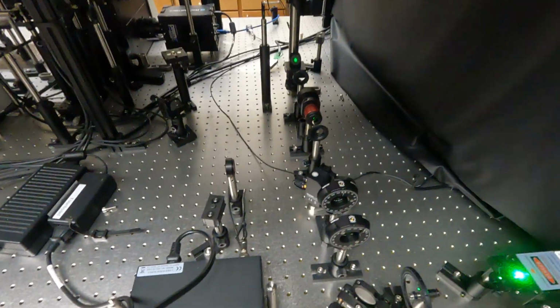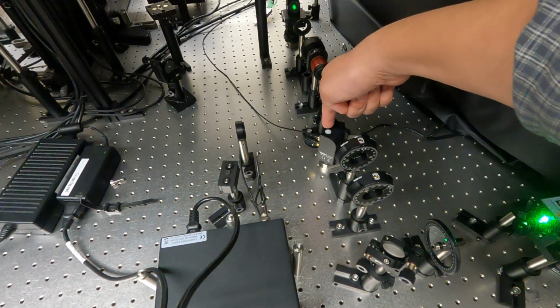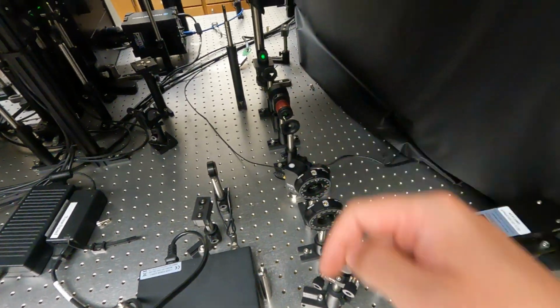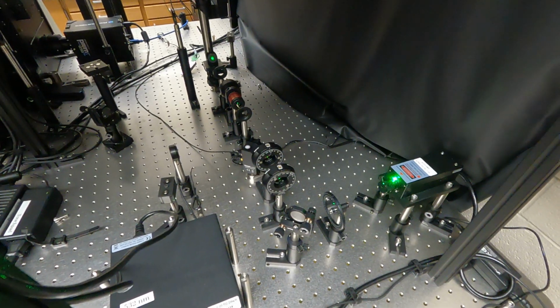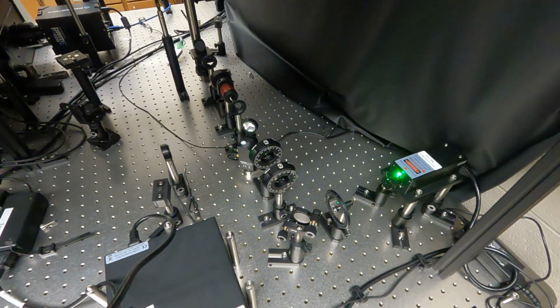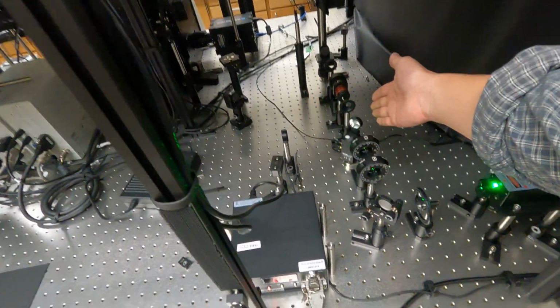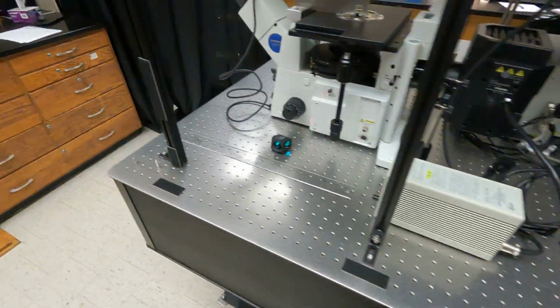One other thing worth noting is that this flipping mirror could also act as the laser shutter that can block the laser light from accessing the microscope body. For instance, if you're in the middle of the experiment and you do not want your sample to sense any of the laser beam, you can simply press this button and rotate the flipping mirror to an upright position. That way the laser will get reflected right at this mirror. No beam will actually get into the microscope body.